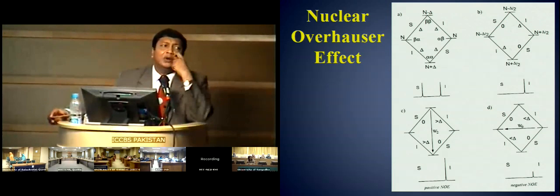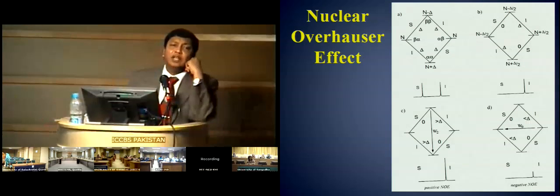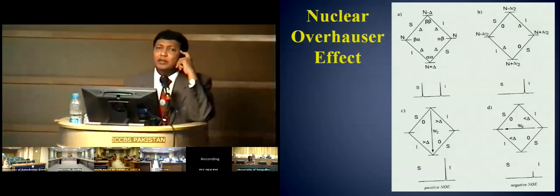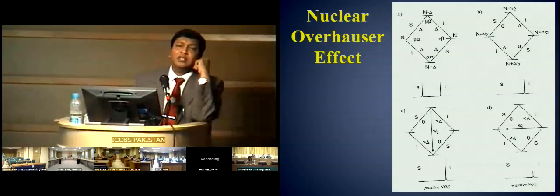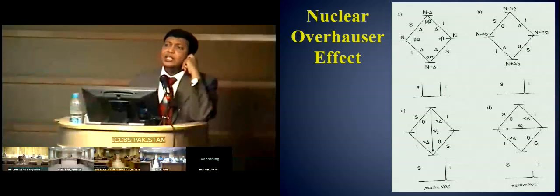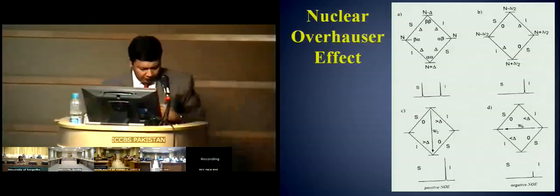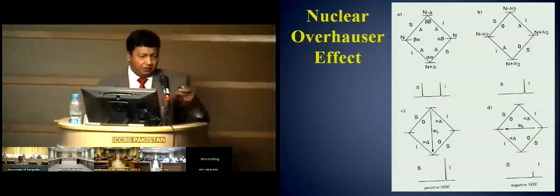That's why I didn't go through that, because by having a two polarization transfer, you eliminate the possibility of C12. C12 doesn't really come into the picture because proton can transfer energy to C12, but C12 cannot transfer the energy to proton. That only happens when you have a coupling spin half nucleus. Thank you very much. Thank you.